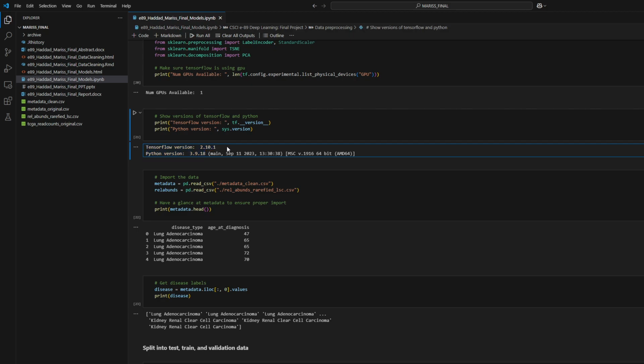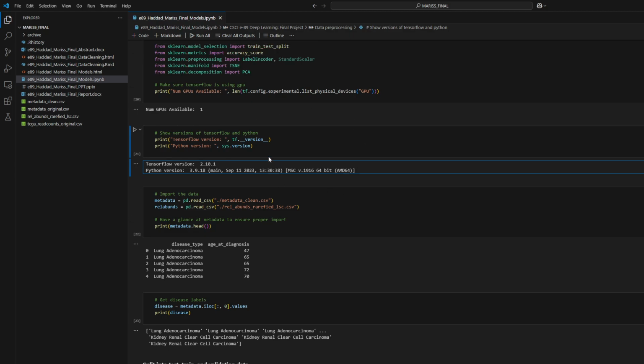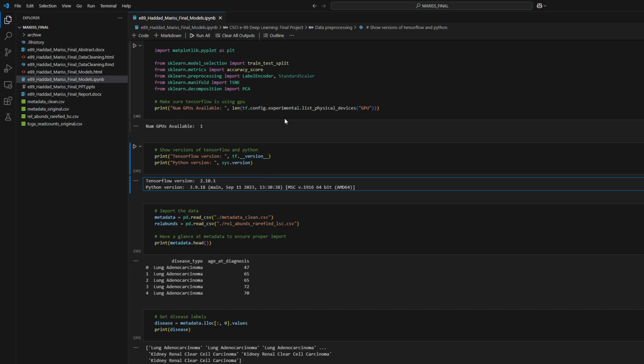And if you're running more recent versions, so like, I guess if you're using WSL or not a Windows machine, like a Mac or a Linux machine, then you might have different versions of TensorFlow that can access your GPU. But I had to set it up this way because, unfortunately, if I have a more recent version of TensorFlow, then it can't see my GPU.